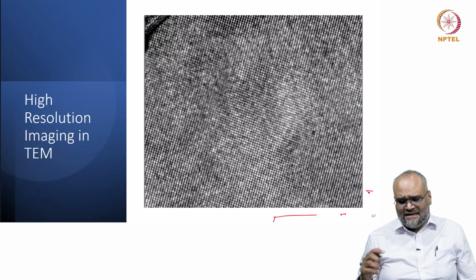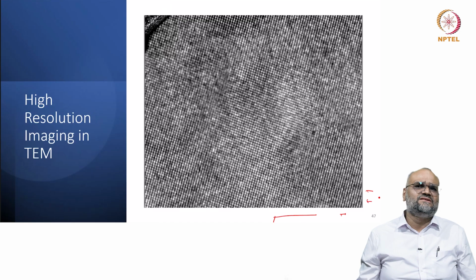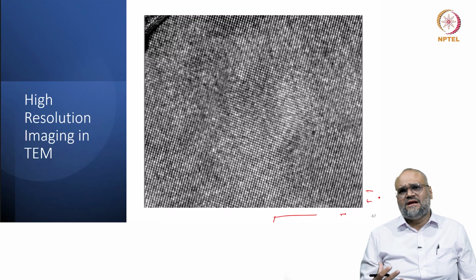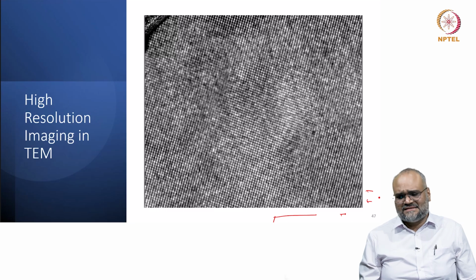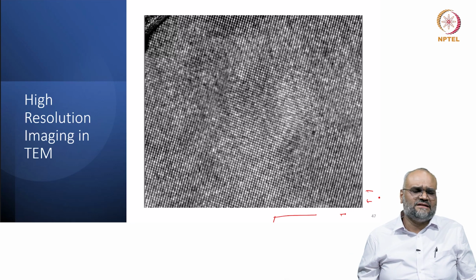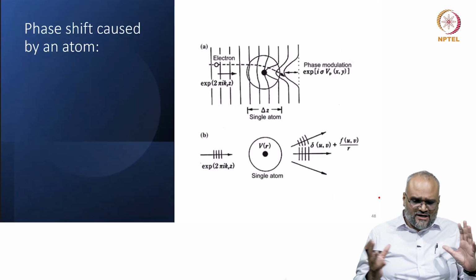Primarily, you have to check the diffraction pattern and orient the crystal into the zone axis. We discussed this in the demonstration sessions, and once you orient it into the crystallographic zone axis and do all the primary corrections, you can then start imaging and get high resolution information from that particular material. So, where do we start this?